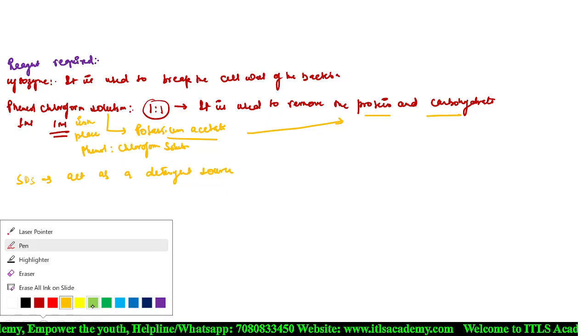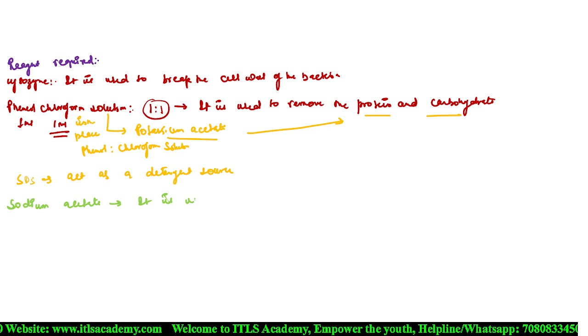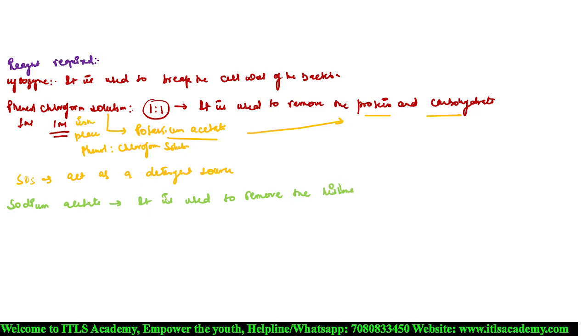Next is sodium acetate. Sodium acetate is used to remove the histone protein.